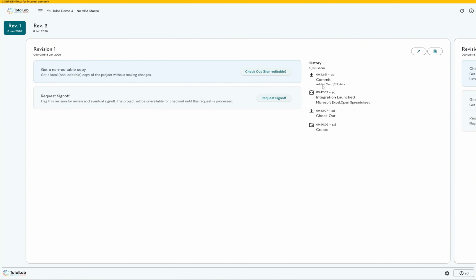But we do have the ability for people to add it themselves if they want to kind of keep a log and build that as part of the audit trail in the notes function itself. But this isn't automatic, and this is kind of the price that we pay without having that direct integration. So the price we pay is we can't get line by line, cell by cell audit trails, but also we do completely hash the file, and this is only checkoutable in a read-only version.